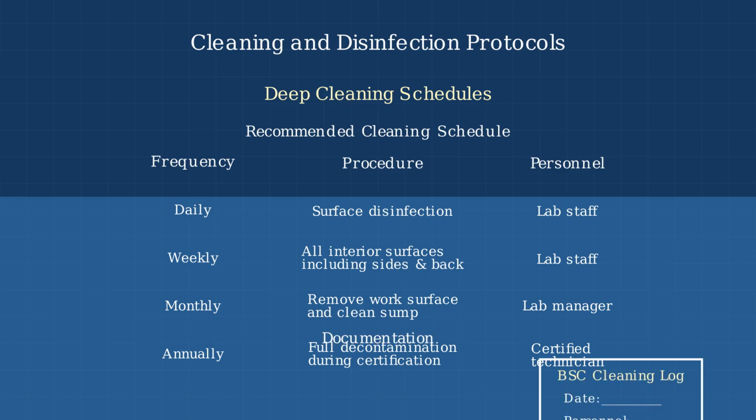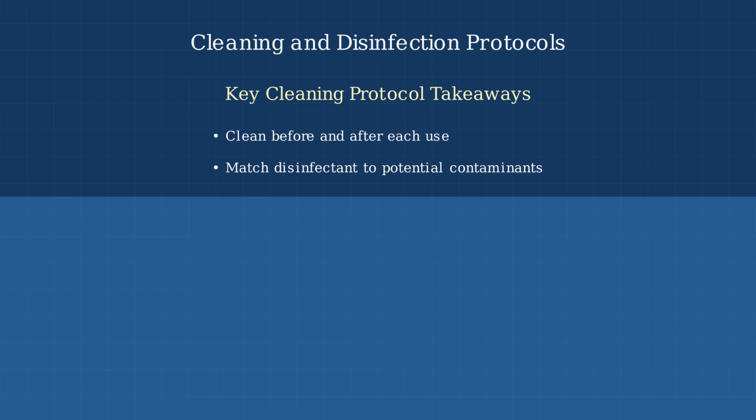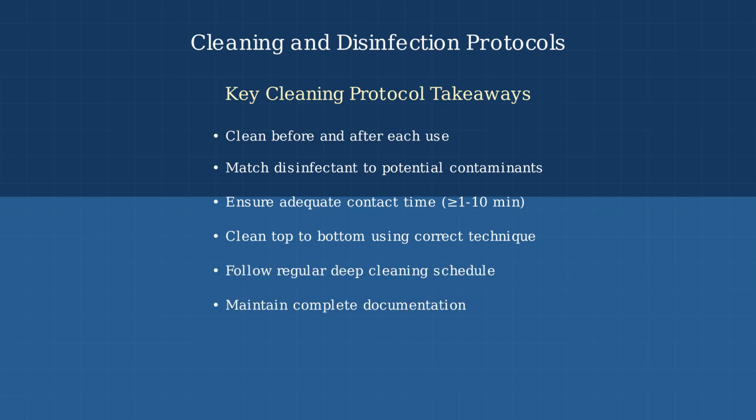All cleaning activities must be documented in a logbook, including the date, personnel performing the cleaning, and the specific procedures completed. To summarize key cleaning protocols for biosafety cabinets: clean surfaces both before and after each use. Match your disinfectant to potential contaminants in your work. Ensure adequate contact time, typically 1 to 10 minutes depending on the disinfectant. Always clean from top to bottom using correct techniques to prevent recontamination. Follow a regular deep cleaning schedule beyond daily procedures and maintain complete documentation of all cleaning activities.